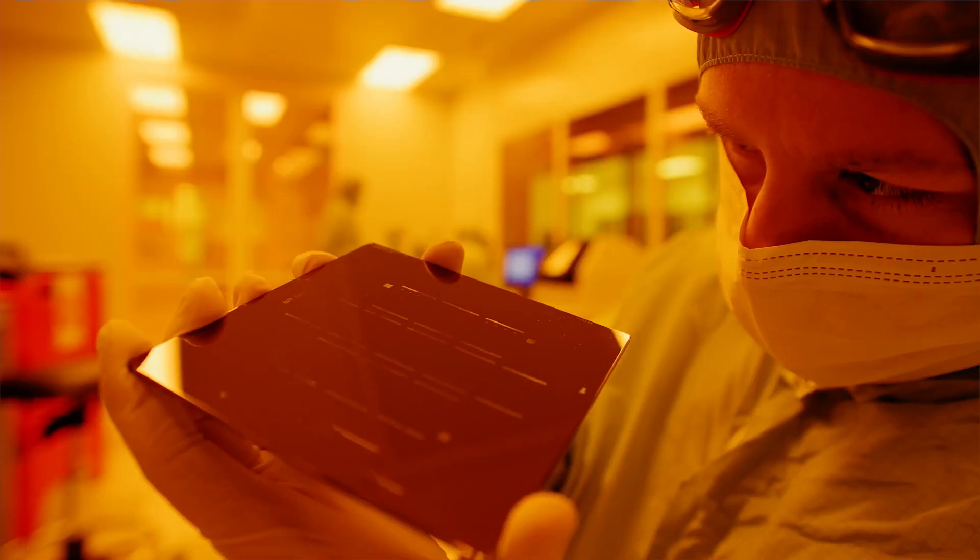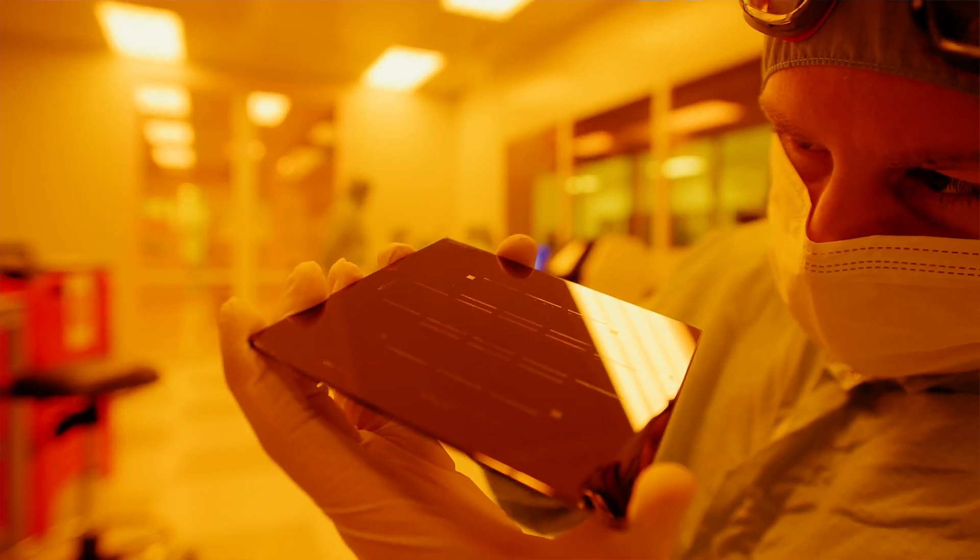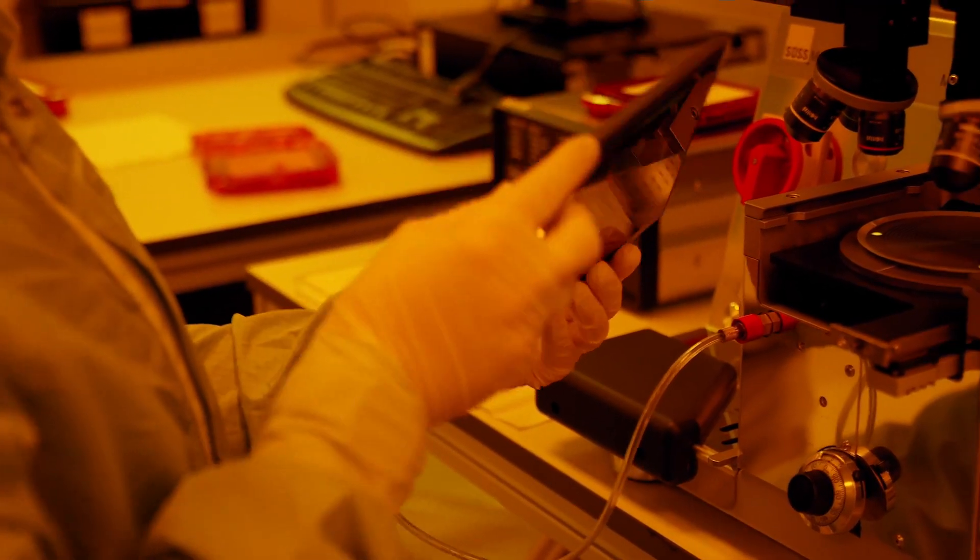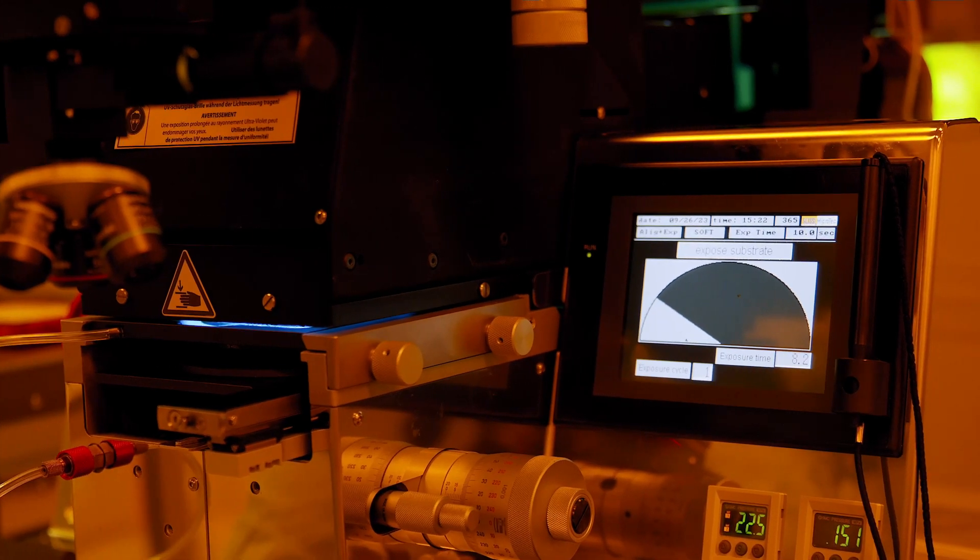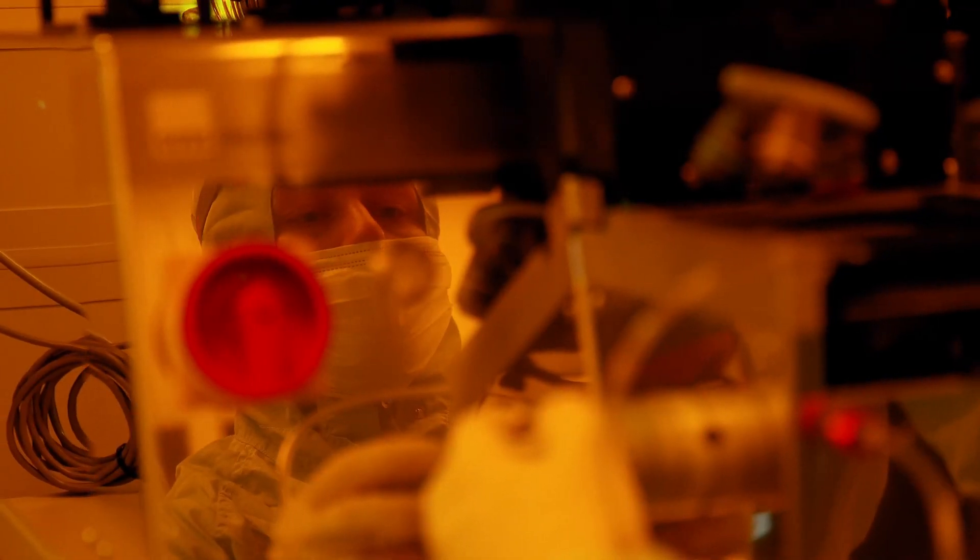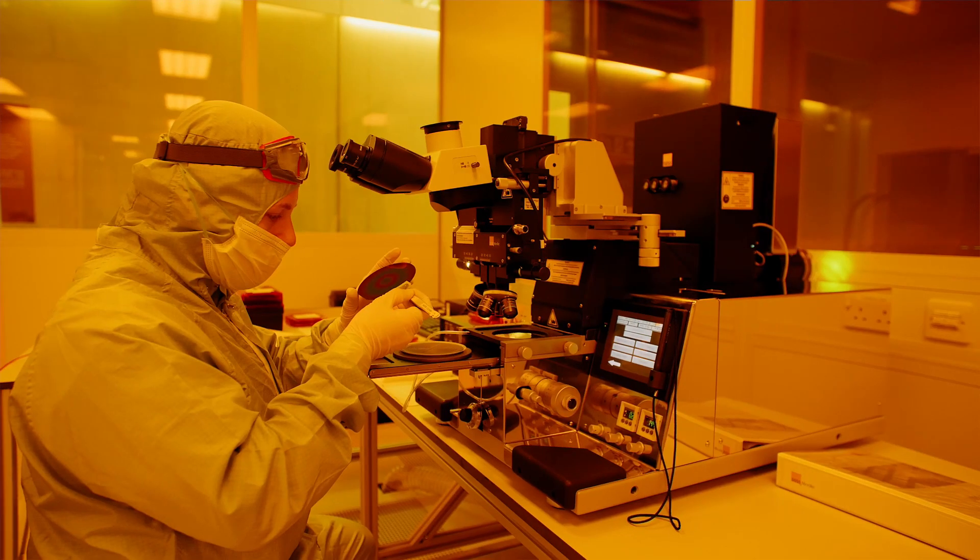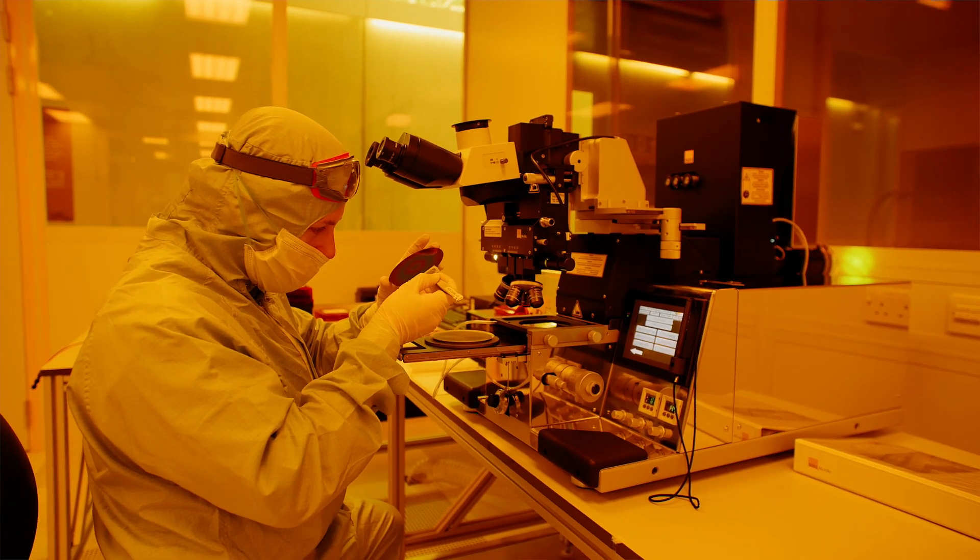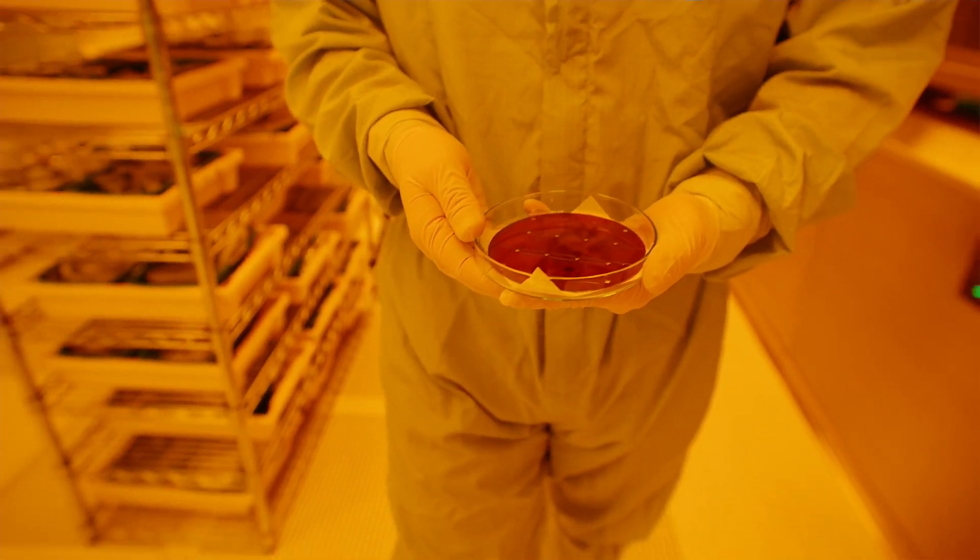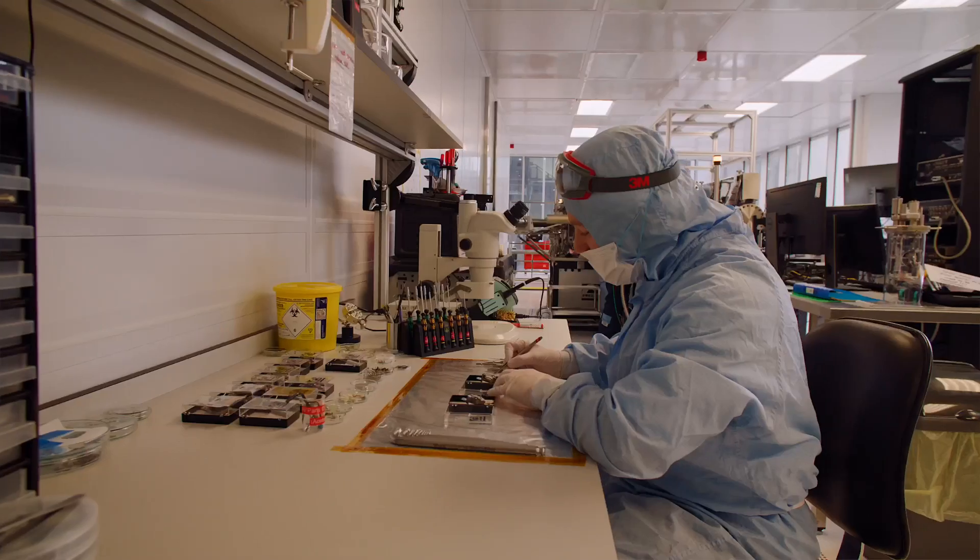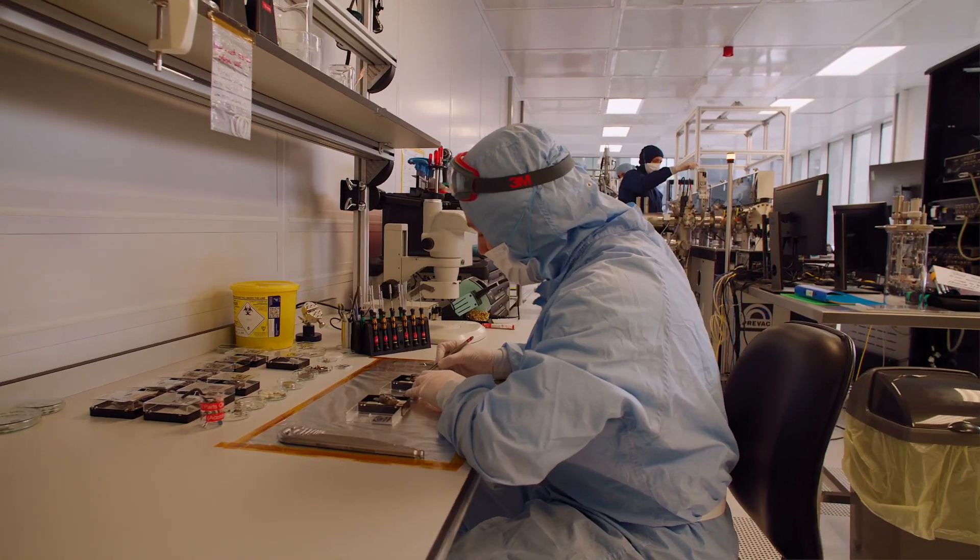We have a set of two stages, one which holds our crystals and the second which holds a set of metal-coated silicon nitride membranes. These were something we've had to develop specifically for use in ultra-high vacuum, because traditional methods of transferring crystals use polymer stamps which outgas significantly and introduce a lot of contamination into devices. By using these metal-coated membranes instead, that are suitable for use in UHV, we can make the devices much cleaner.